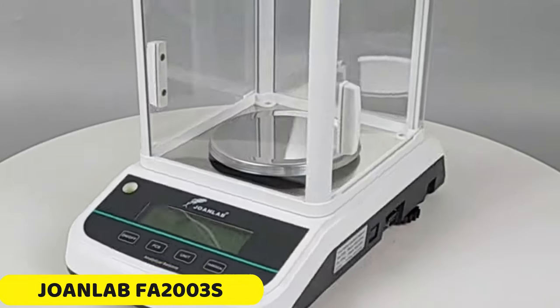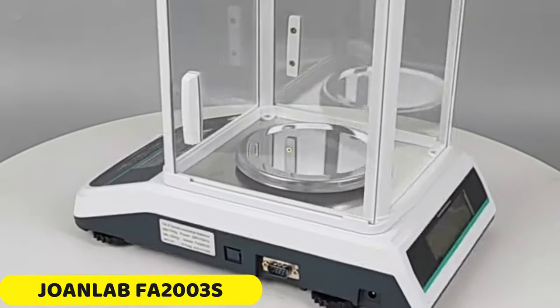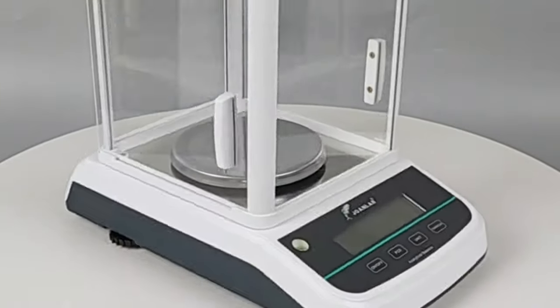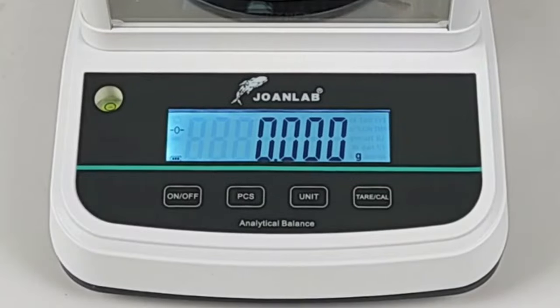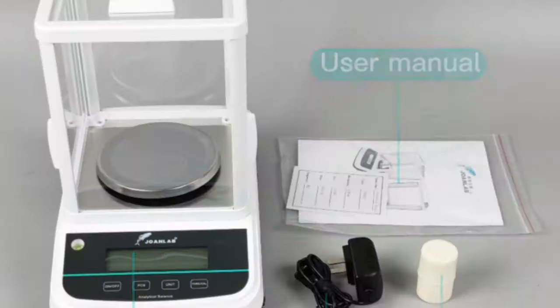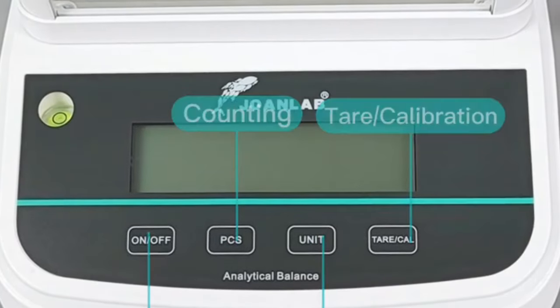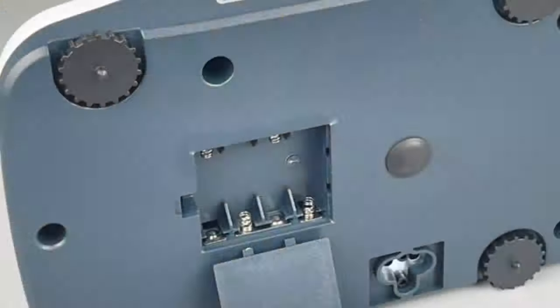Number 1: JoanLab FA2003E Analytical Balance. The JoanLab FA2003E Analytical Balance is a precision electronic balance that combines precision, functionality, and durability. It offers versatile weighing capacities of 200 grams, 300 grams, and 500 grams, with a resolution of 0.001 grams, ensuring accurate measurements for demanding tasks.